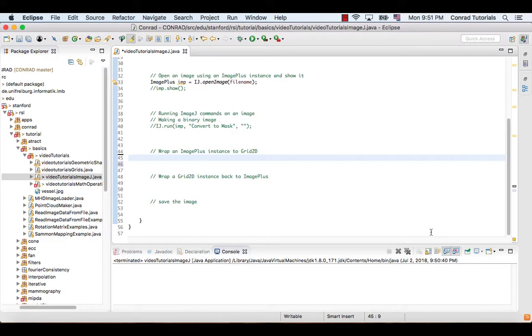In order to do that, we need to call the static function wrapImagePlus in the class ImageUtil.